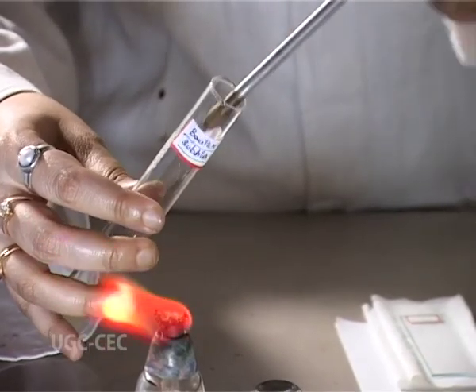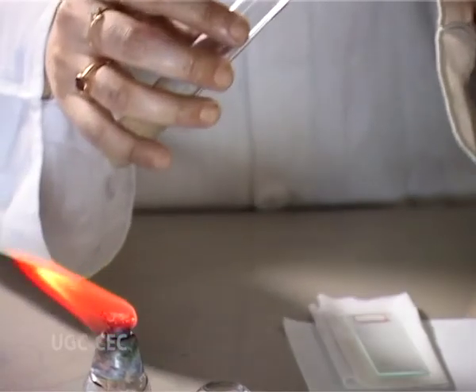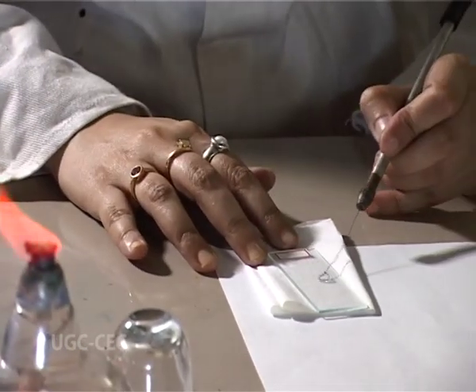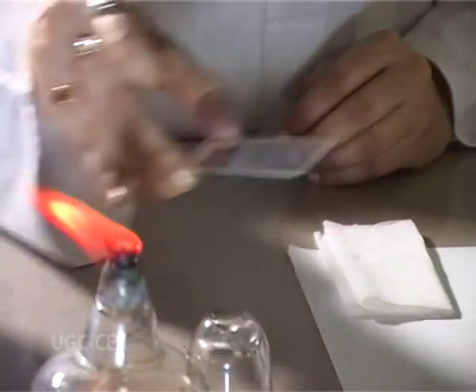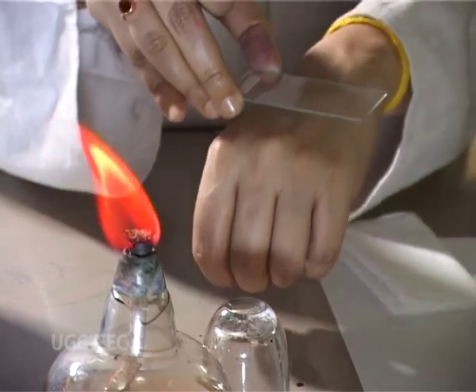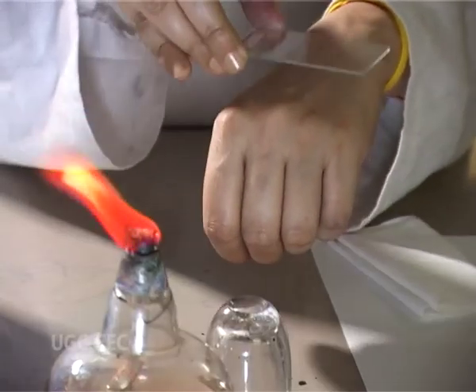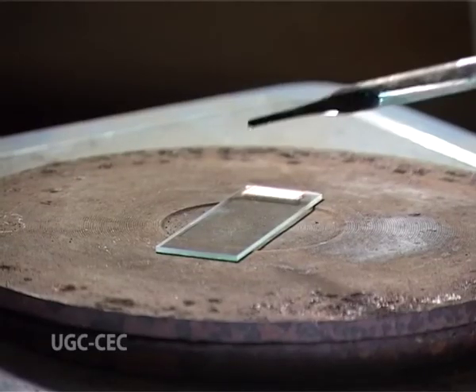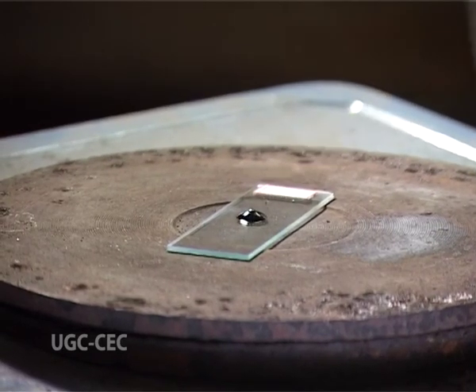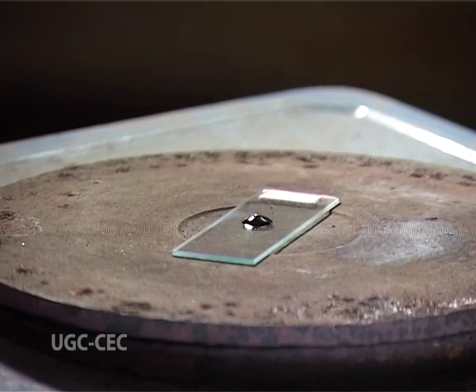Now, what is the procedure? First, we prepare a smear of culture on a clean grease-free slide. We air dry the smear and then we heat fix it. After the heat fixation is done, we stain it with malachite green and keep it on a hot plate, because heating helps in the penetration of the primary stain.